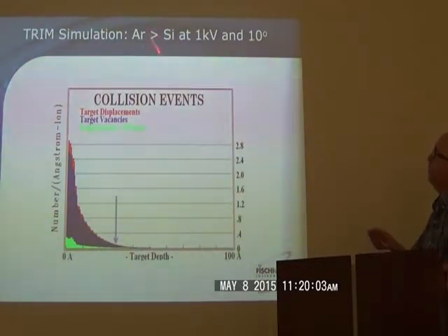Another thing you can do is go online and get this famous or infamous free software, depending on your point of view. It's called TRIM/SRIM. You can simulate the sputtering process and predict fairly accurately how much amorphization will be left.